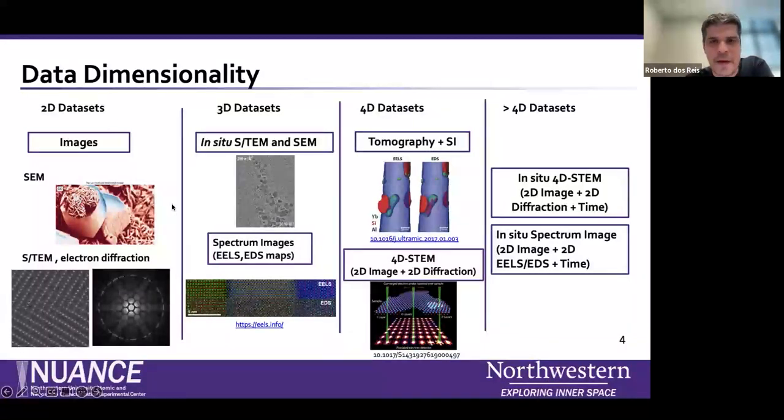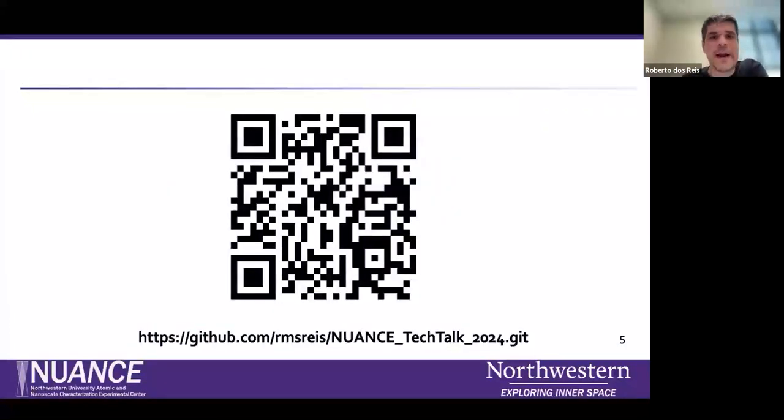I have prepared some codes for all of these possibilities, so you're going to have access to that after this talk too. The idea is that I'm going to code live with you. So if you want to follow along or just watch the recording of this, you can access this GitHub repository. The URL is here at the bottom.